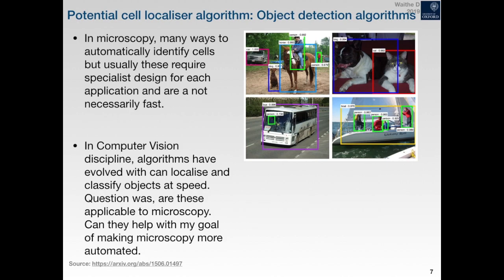So we can combat this by using machine vision and computer vision, and there are very powerful algorithms within this field which can be trained to recognize objects in a scene, conventionally in photography. And to train something like this, you just have to do bounding boxes. Although the design of the algorithm was very elegant and done by real experts, to actually use it, you don't have to be a massive expert. You just have to be able to draw bounding boxes around things that you like. This class of algorithm is called an object detection algorithm, in that it allows you to find and localize objects in a scene, and it also allows you to find the class of that object, as in, is it a person, is it a horse? And you're allowed to have many classes in one image, which is very powerful.